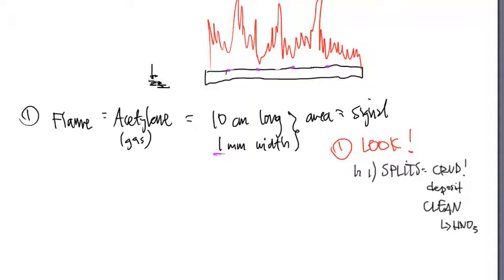Okay? So keep that in mind. Always look at your flame throughout the analysis.